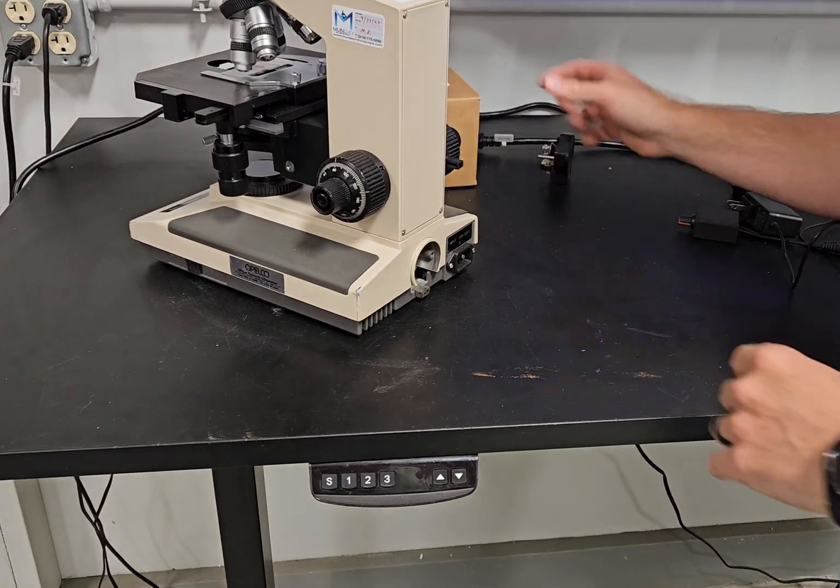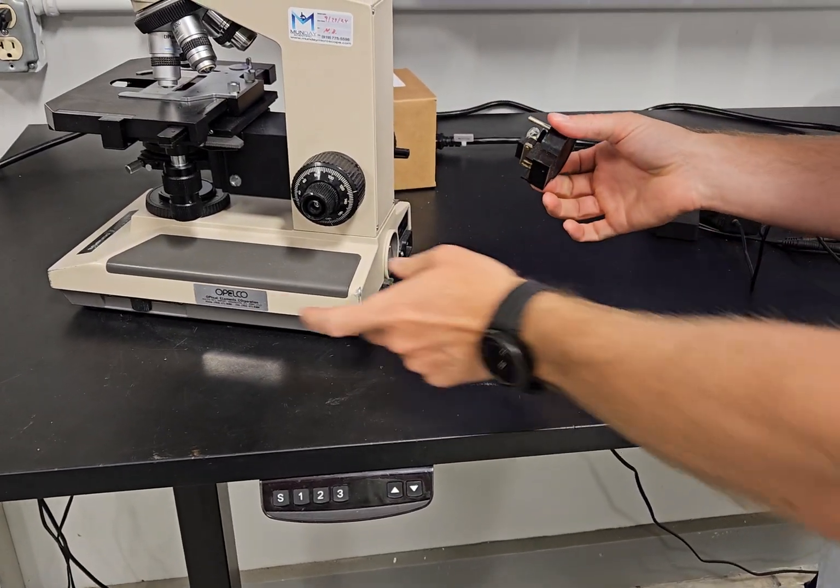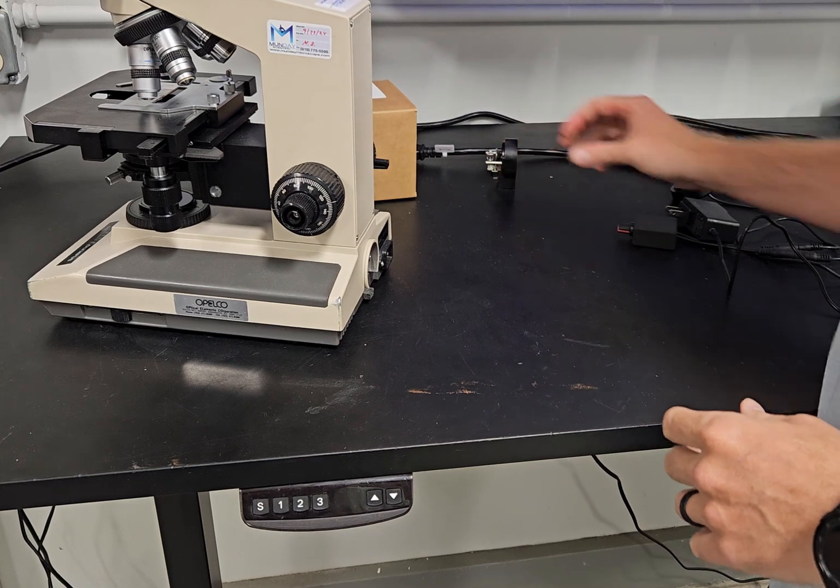You're going to remove the old lamp house — that's usually the culprit. The lamp house may be bad, the electronics may be bad, or you just may want to upgrade to LED.